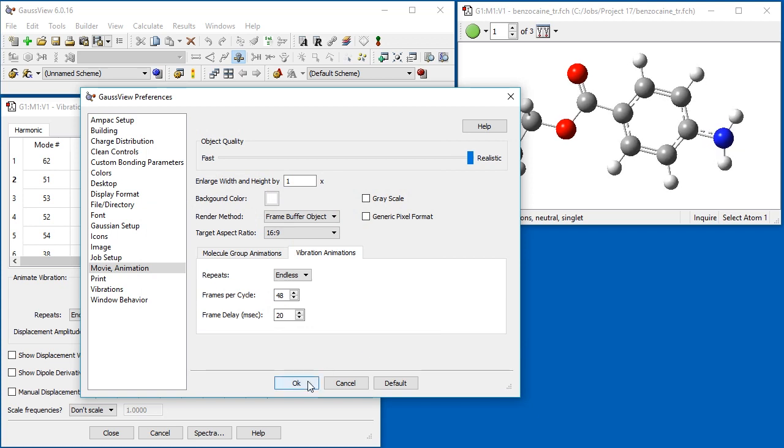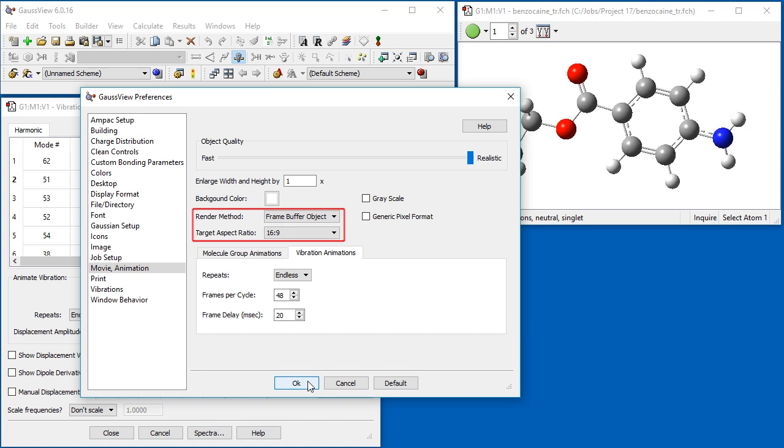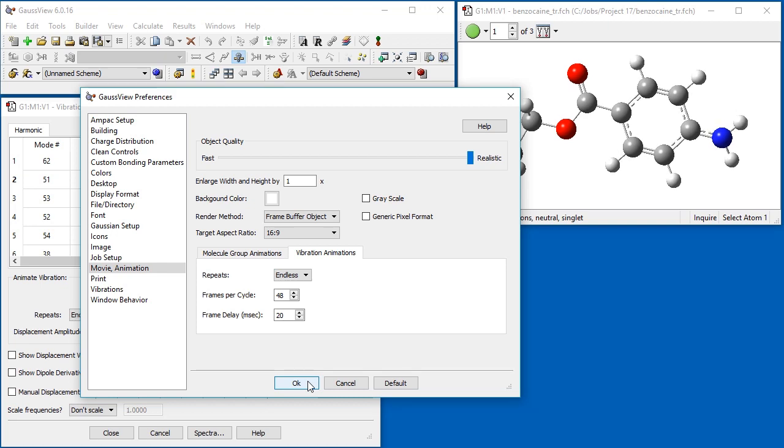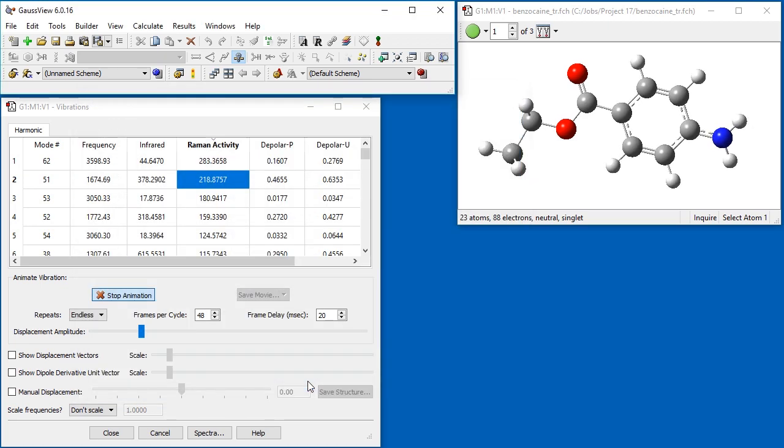There are also choices for the rendering method and the aspect ratio of the generated movie. We keep the default aspect ratio which is correct for high-definition format. The three fields in the Vibration Animations section are the same as those in the Vibrations dialog.